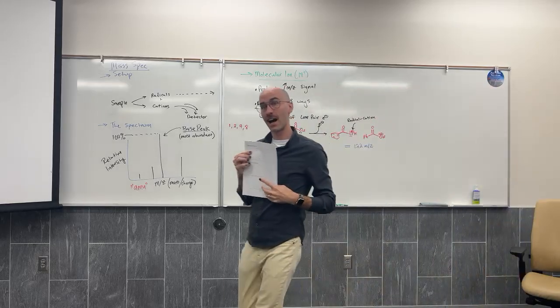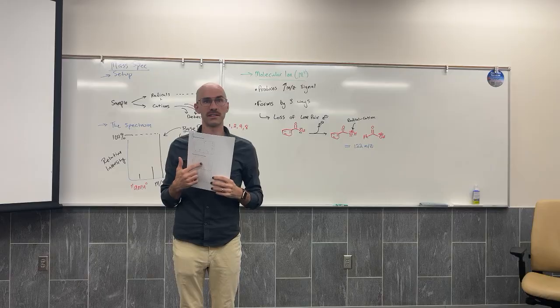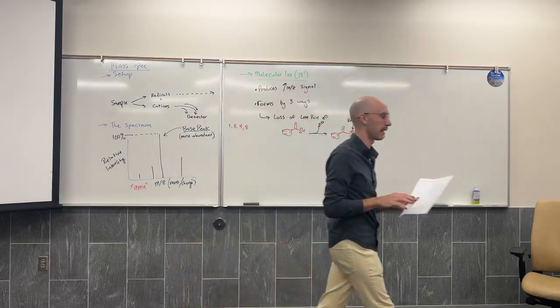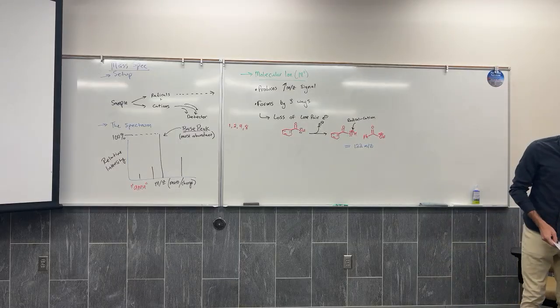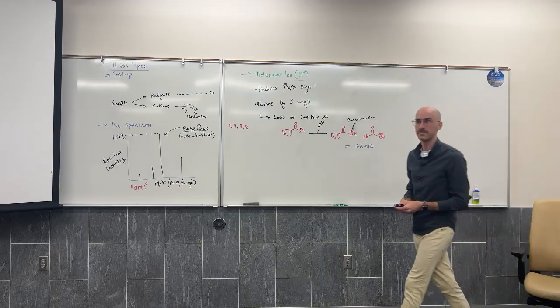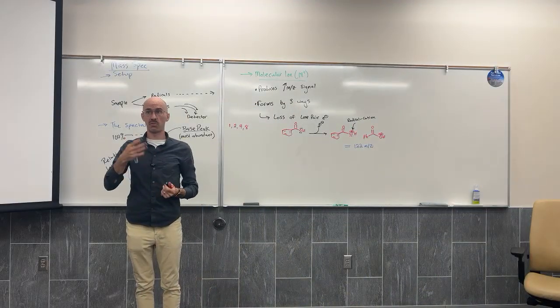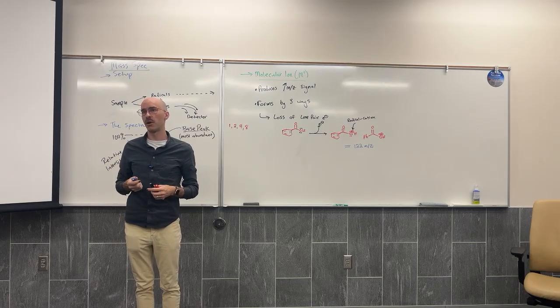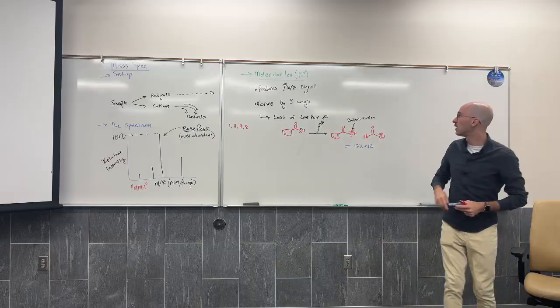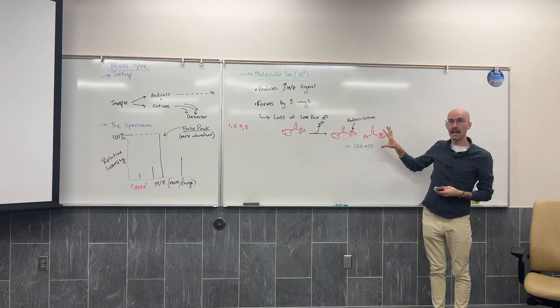We're not looking at the very top spectrum. We're looking at the one just under molecular ion and base peak. Do you see a signal on the spectrum at 122 mass per charge? Sure do. Is it the base peak? No. It's not. It's close to it. It's like one of the most abundant signals, but it's not the most abundant signal. So that signal on your spectrum you can label as M+. And this might be how it got there.